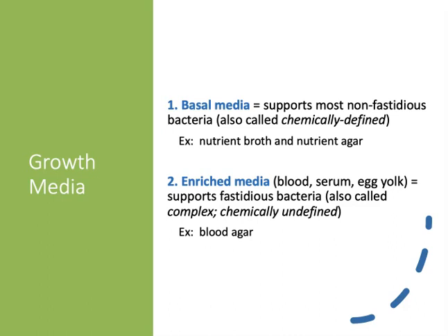We sometimes call enriched media complex media because it has those complex ingredients in it. We also sometimes call it chemically undefined media because these complex ingredients contain so many different molecules that we can't just list them the way we could with a basal medium.